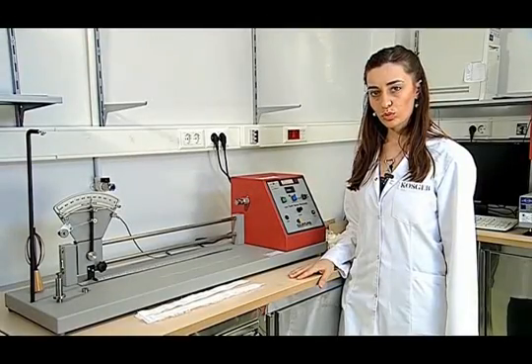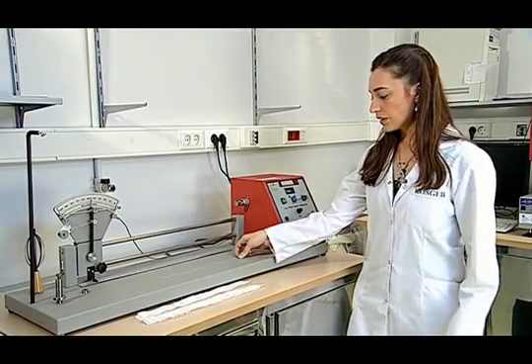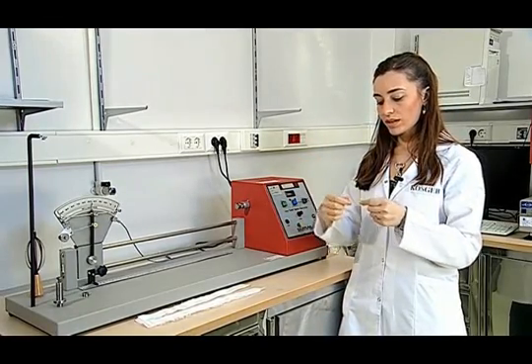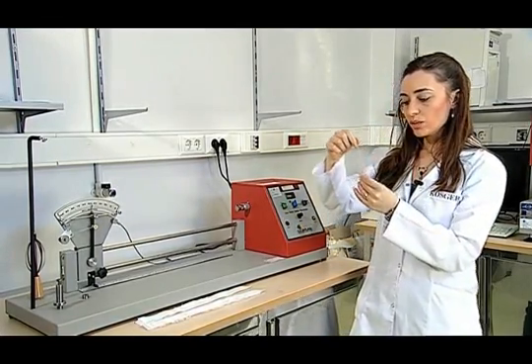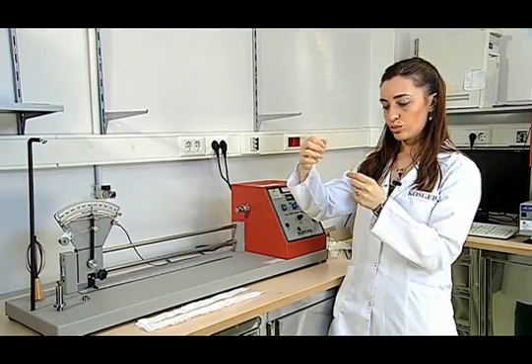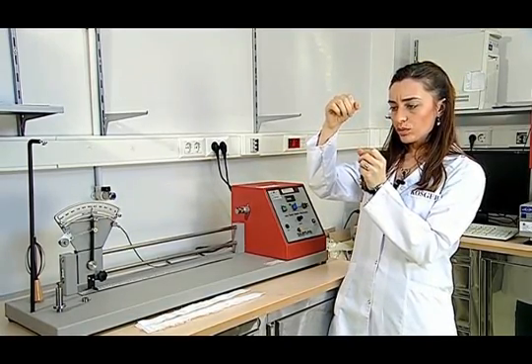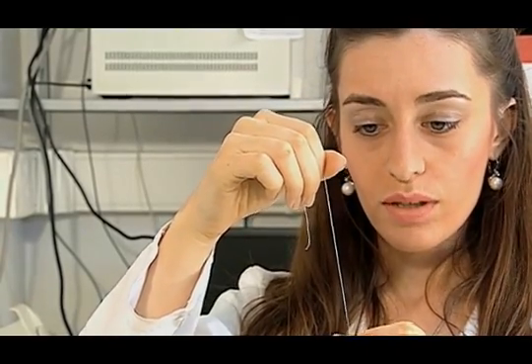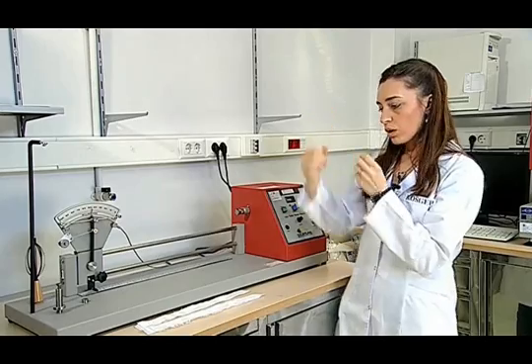The direction of the yarn twist for the samples should be checked before performing the twist determination test. Some yarn not shorter than 10 cm is taken from the fabric and then investigated while holding it in a vertical position. The determination of the twist is done according to the resemblance to the middle parts of the Z and the S letters. If the twist is more like the middle curve of an S than a Z, then it is called an S twist; otherwise it is called a Z twist. When we investigate this yarn, we see it as a Z twist.